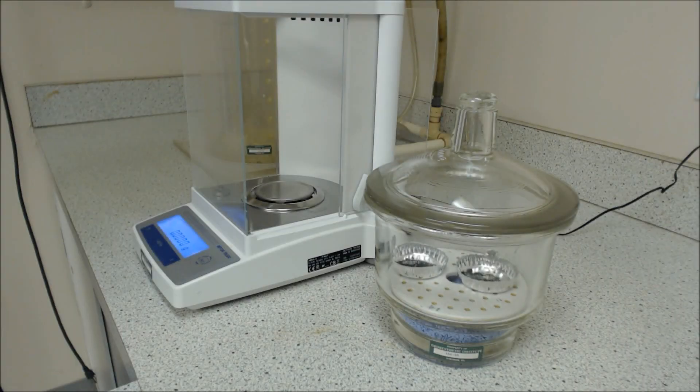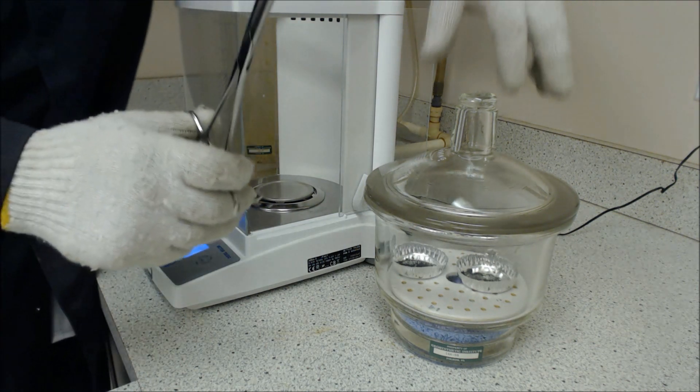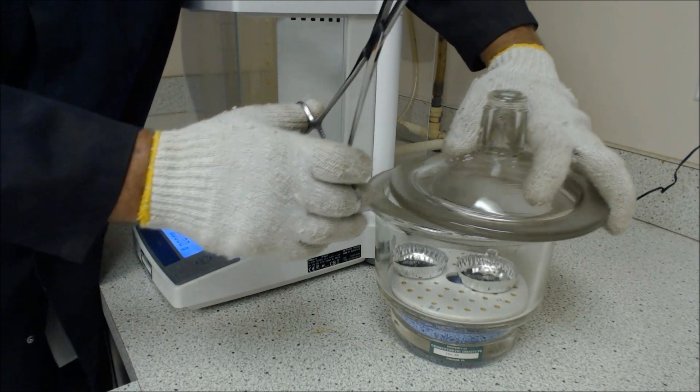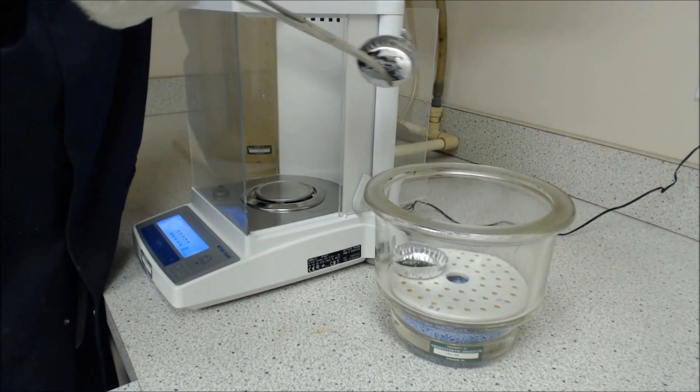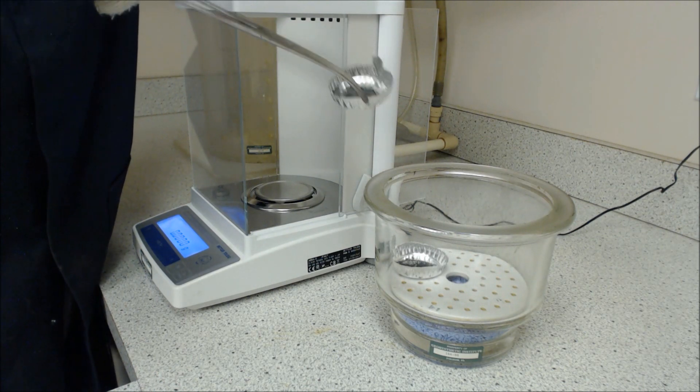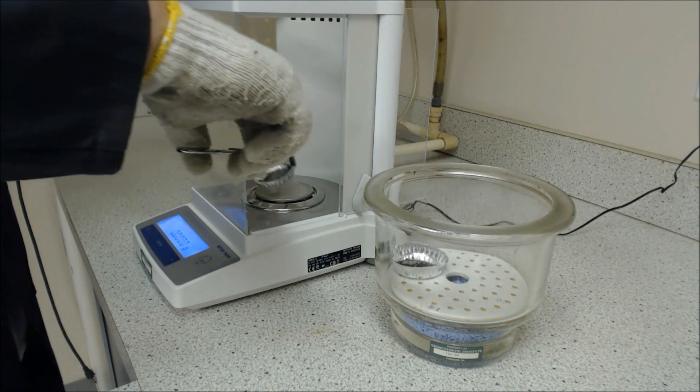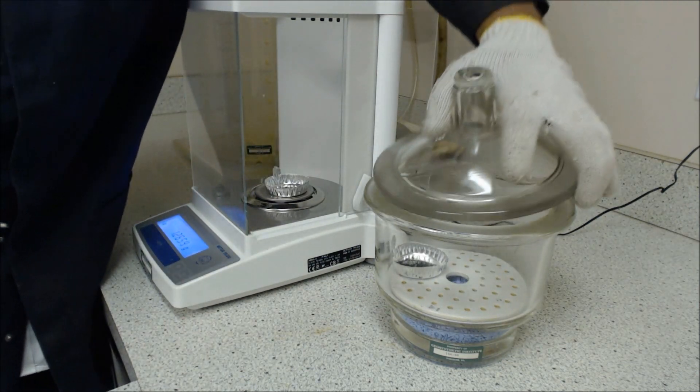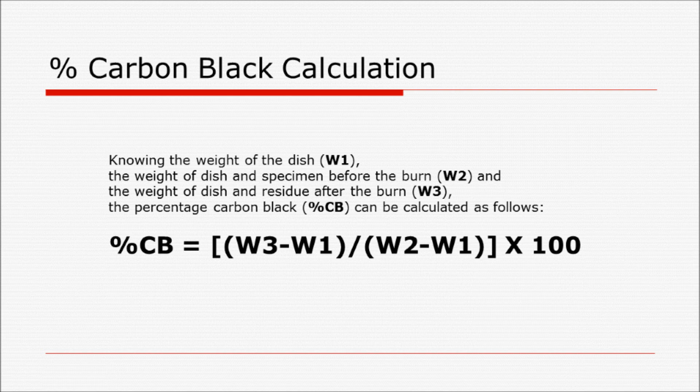We're here now after the burn, which was three minutes, and then subsequently two minutes in the desiccator. We have the two specimens prepared. You take them out. You can see it's powdered now. This material is in powdered form. You introduce it into the analytical balance and subsequently take the mass from which you can do the calculation.